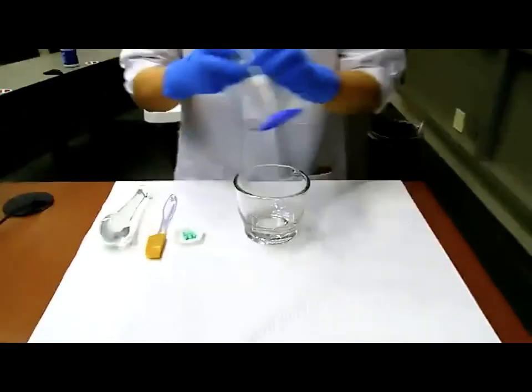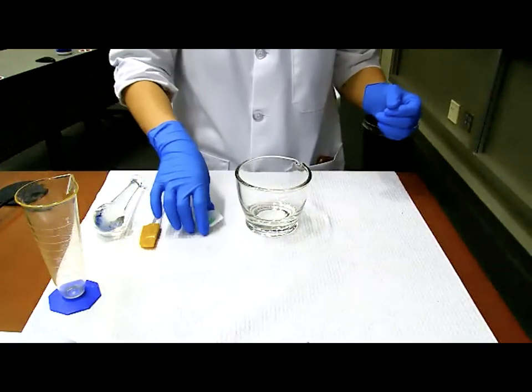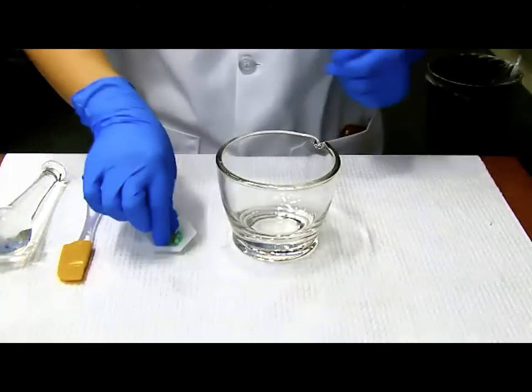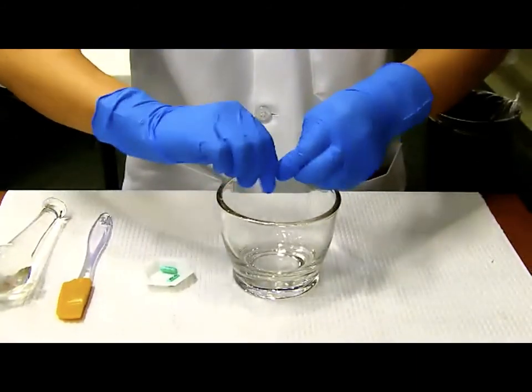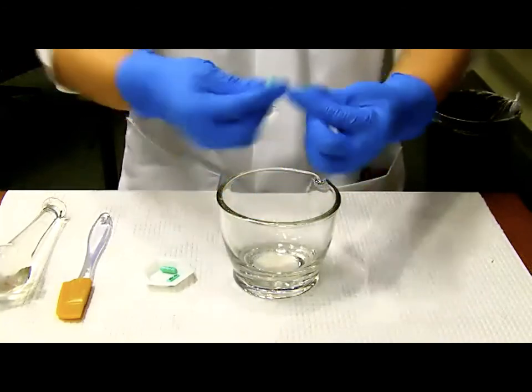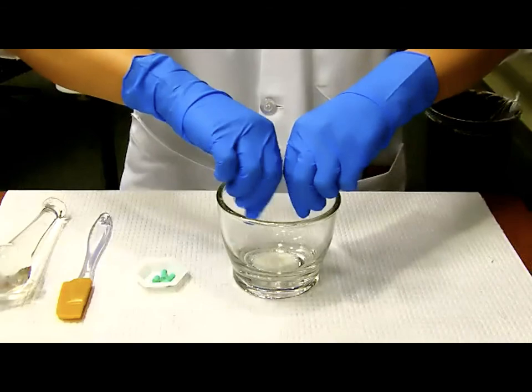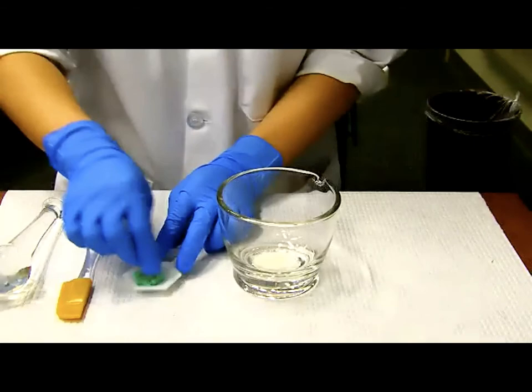Okay, all right. This is probably the easiest dosage form that you can imagine in the semester. So I have 3 capsules here. I'm going to open them up. Do I need to know the weight of those capsule powders? No, I don't. So instead of opening them in a weigh boat, I am actually going to open them directly into my mortar. You guys have had enough experience with capsules, so I'm not going to do the slow motion here. So that's 1. Make sure it's all complete. And here comes the last one.